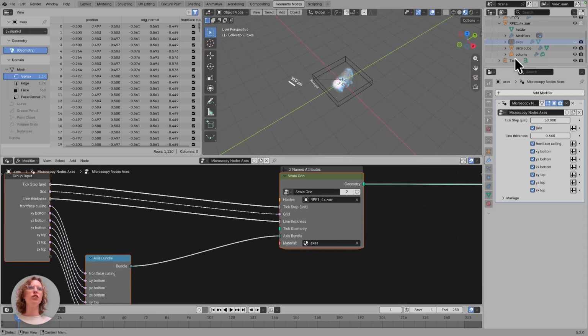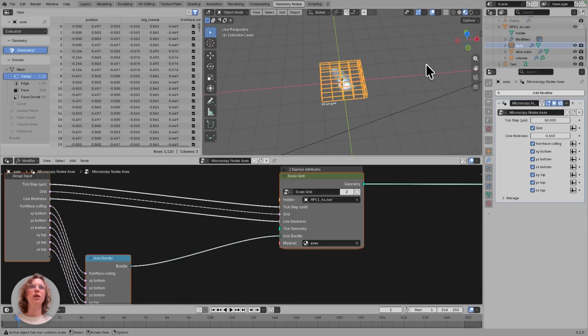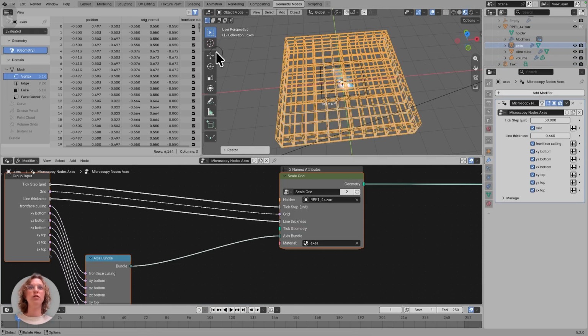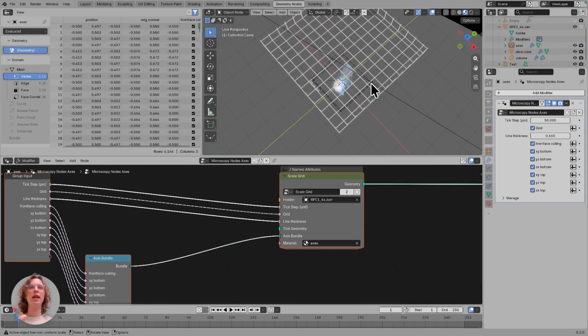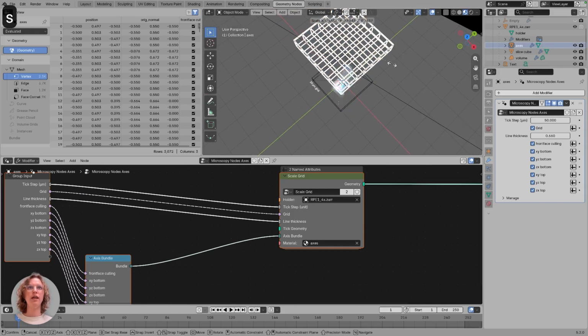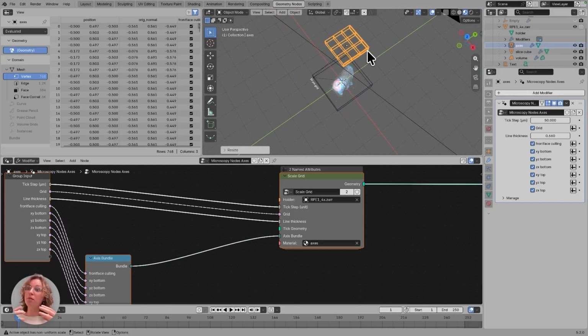One more feature of the axes that's also useful is, let's hide this, that if we select the axes, we can also rescale and move this, and it should always remain the right scaling. So if you've cropped or masked your data, you can still rescale your axes and put it around your object, and it is still a correct scale representation.